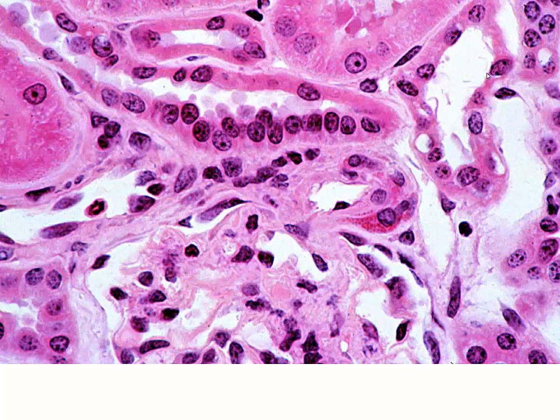Now again, a little bit higher magnification, looking at our juxtaglomerular apparatus. Again, macula densa, portion of the distal convoluted tubule where it comes back beside our vascular pole of the renal corpuscle. And here we have our juxtaglomerular cells, and these are going to be our extraglomerular mesangial cells sort of spread out here in the middle.